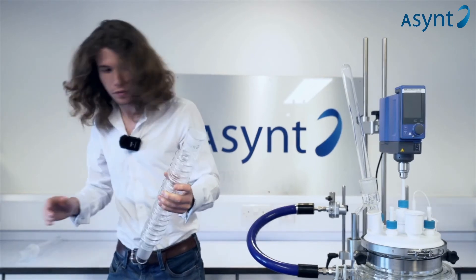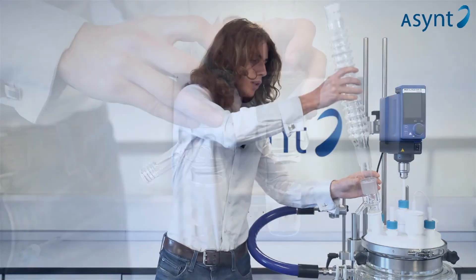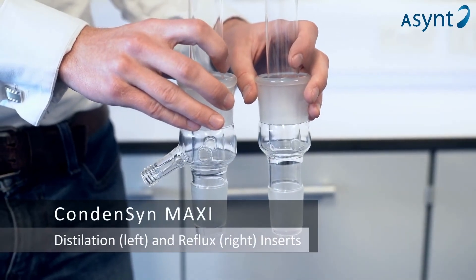Both inners are interchangeable and they both work just as well with a vacuum and the same solvents.